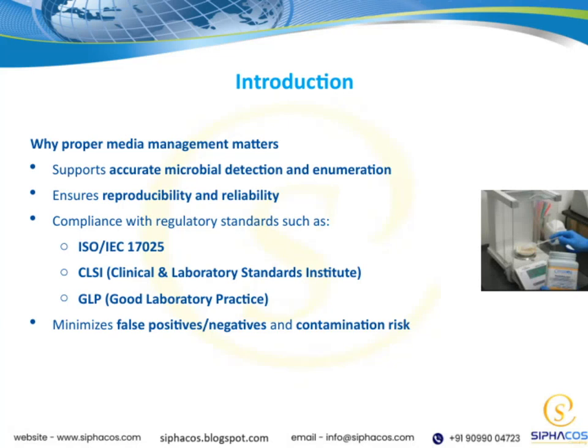Let's talk about why proper media management really matters in our work. First, it supports accurate microbial detection and enumeration, which is crucial for reliable results. When media is prepared and handled properly, we can trust that our microbial counts are correct. It also ensures reproducibility and reliability, meaning that our tests can be repeated with consistent outcomes, which is key for quality control. Another important aspect is compliance with regulatory standards.